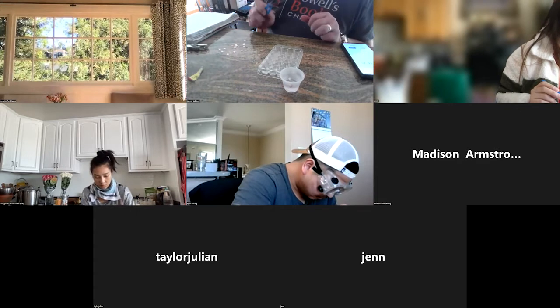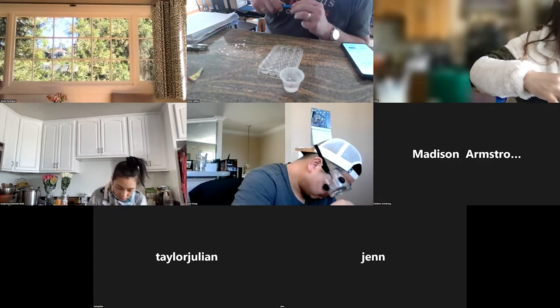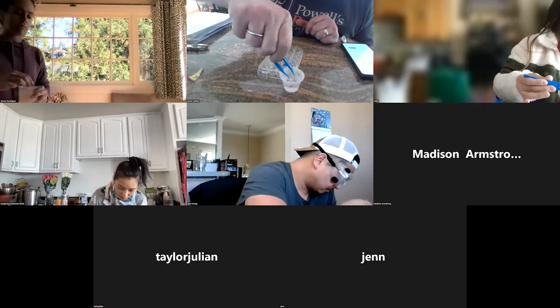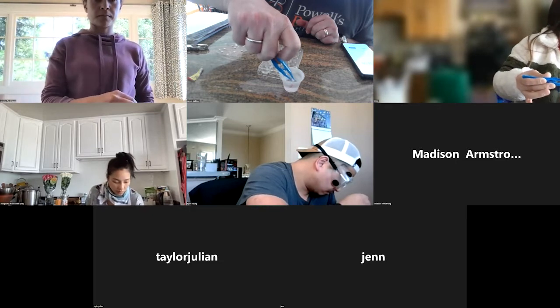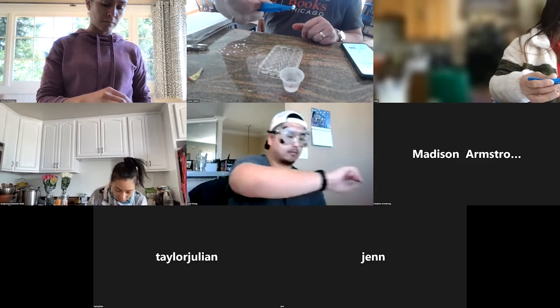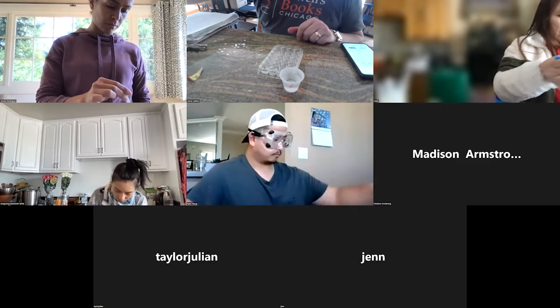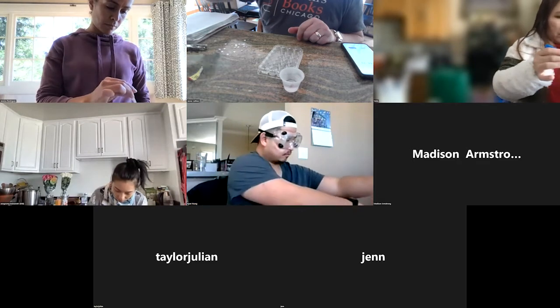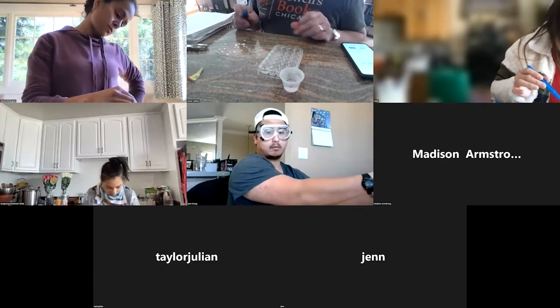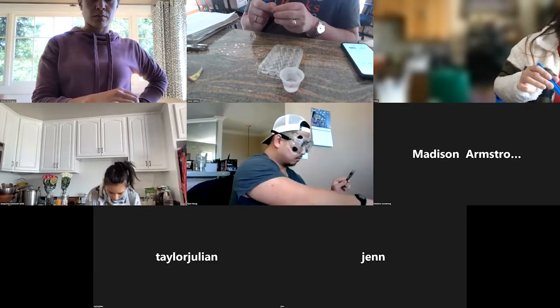Yeah, I think there's going to be a lot of scatter in this data based on how much enzyme you get off of the circles. If you don't dab it a lot, you're going to have a lot more enzyme attached. Yeah, because 35 and 45, that's a pretty big spread.